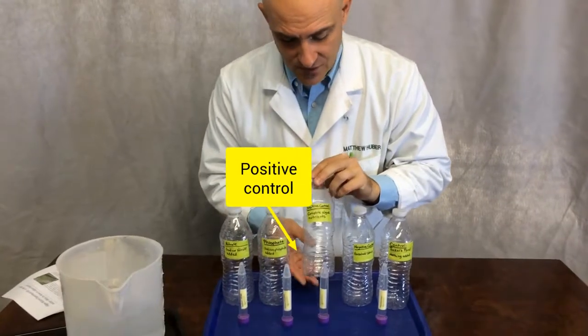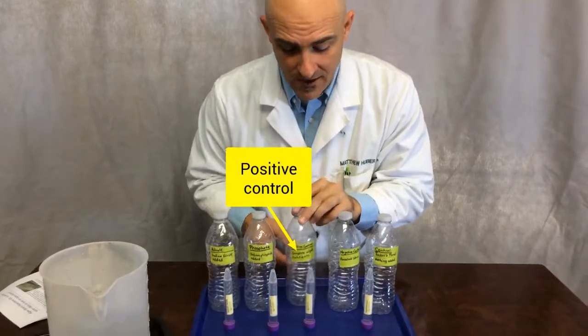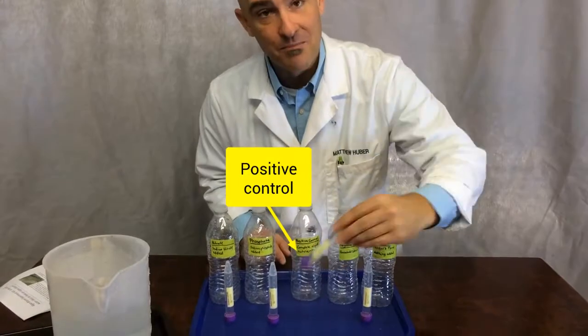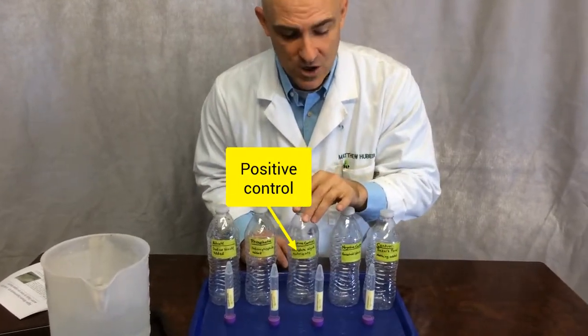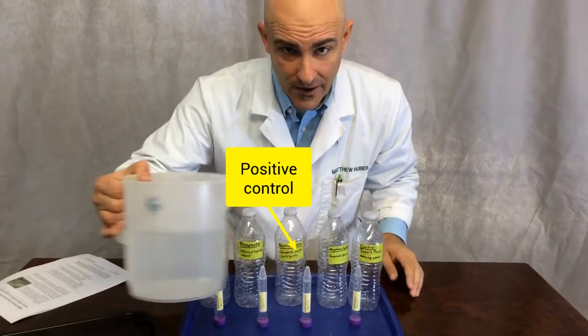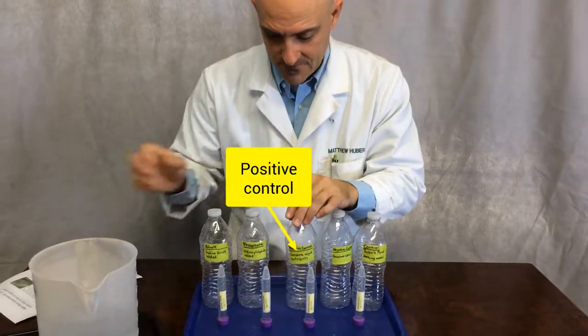The next thing that you'll do is a positive control. Into this container, you're going to add a complete nutrient media for algae. This should cause an algae bloom to occur if the water that you brought in has algae present.